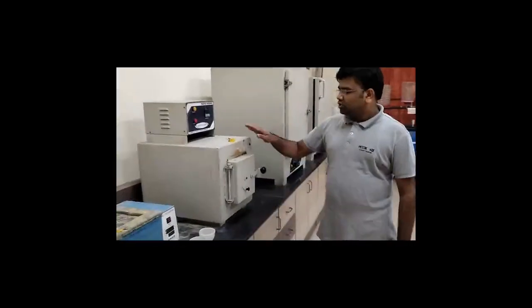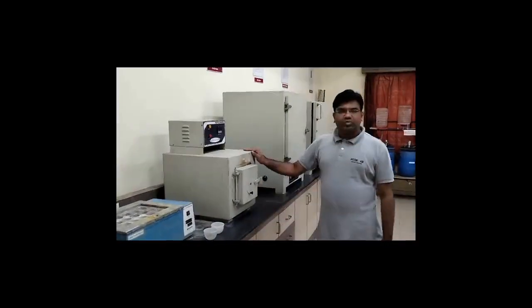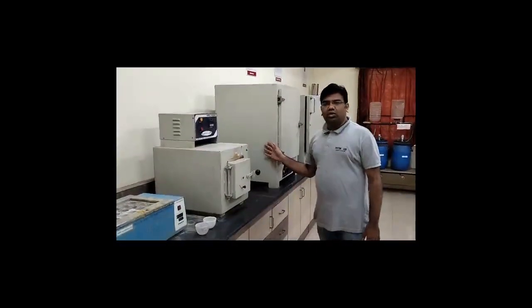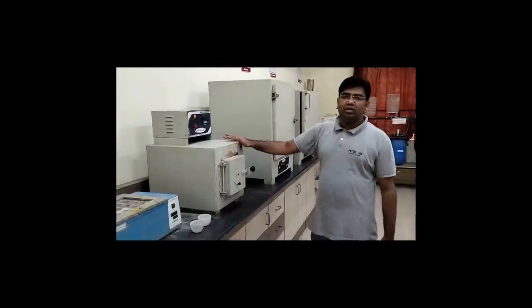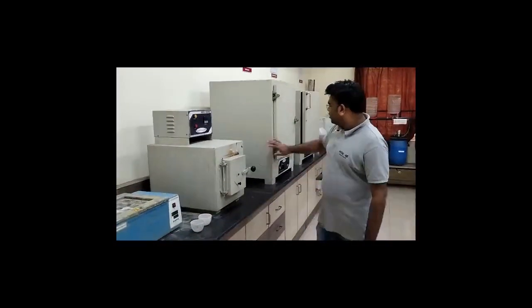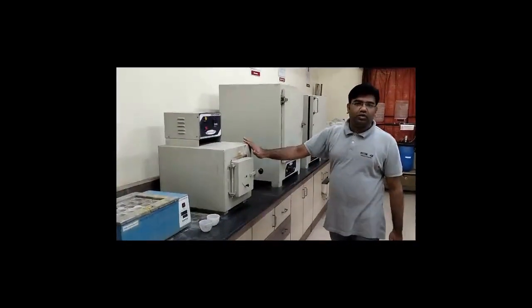Okay, so this equipment is called the muffle furnace, and the muffle furnace will be used for finding out the total volatile solids. So what is the difference between your muffle furnace and hot air oven? The temperature that the muffle furnace can handle is up to 1200 degrees Celsius, and here you cannot handle that particular temperature. Here it is restricted to 250 degrees Celsius only, and the muffle furnace can handle 1200 degrees Celsius.